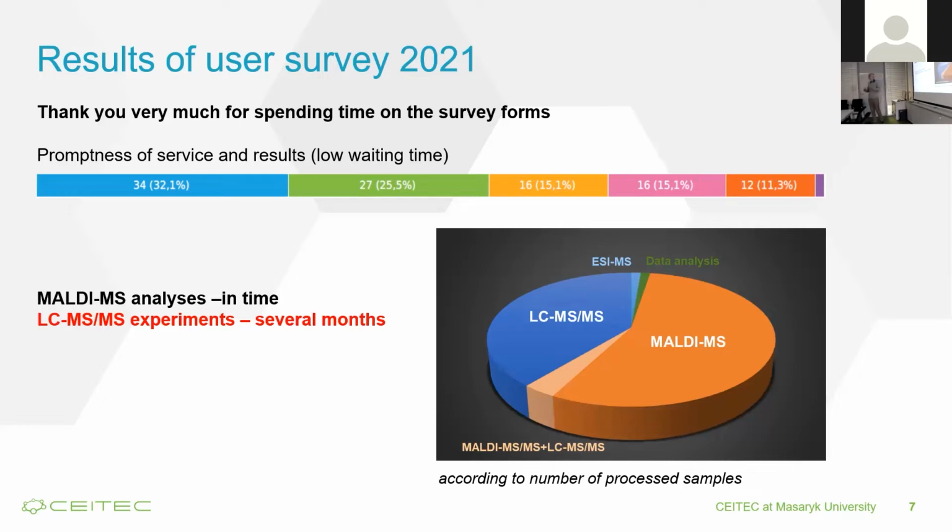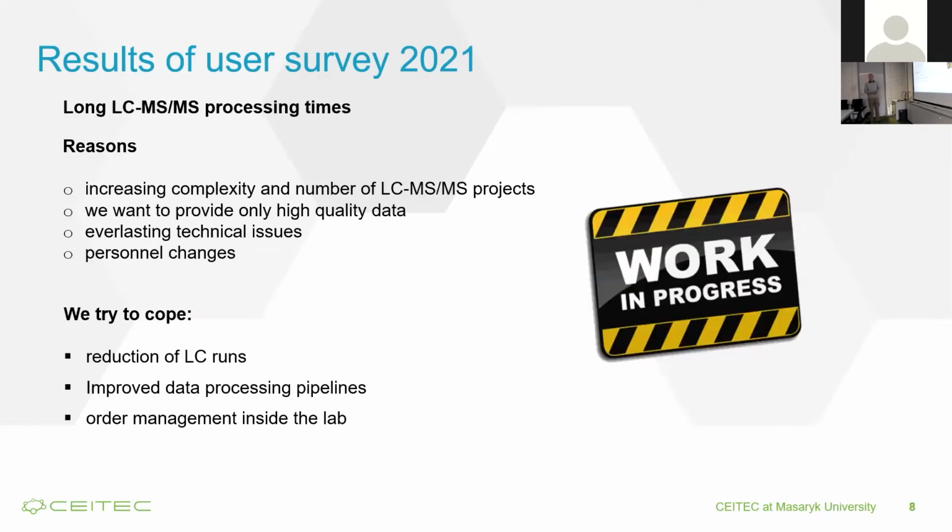They are satisfied with response time, and if you look at the number of processed samples, most samples are on MALDI-MS. It's also because MALDI-MS analysis really flows through quickly in most cases, but LC-MS experiments take several months, so it's sometimes not acceptable for users, I believe. There are several reasons for it.